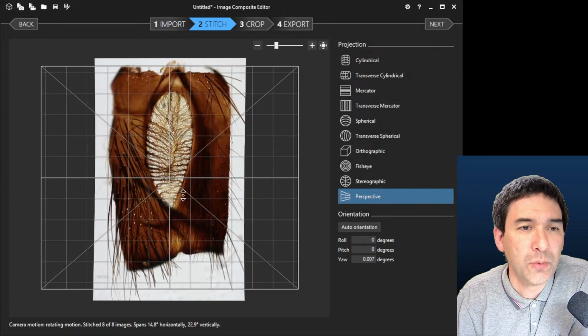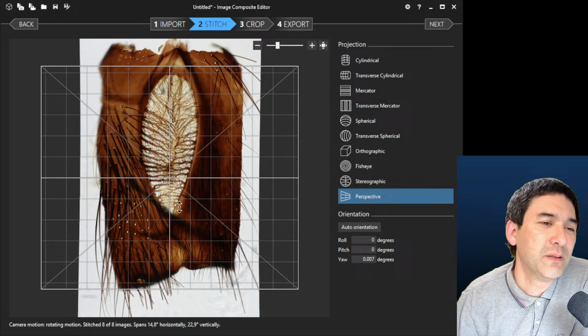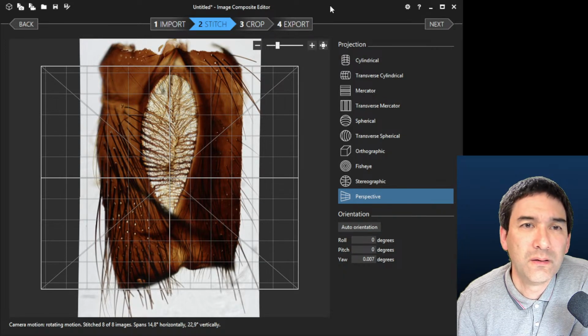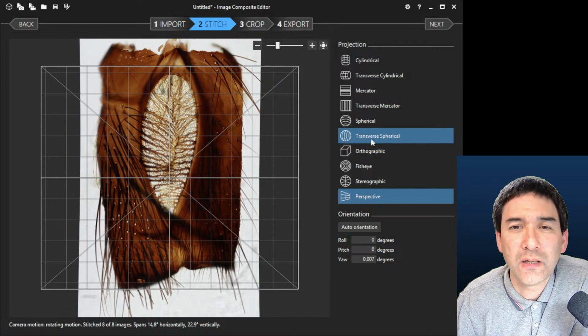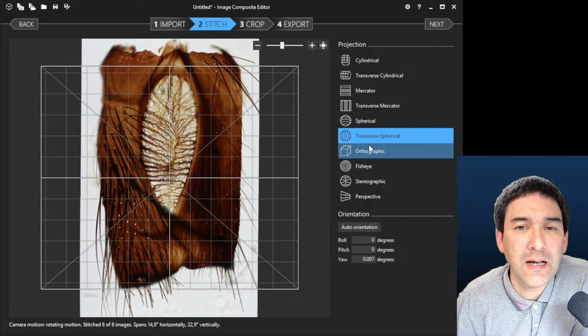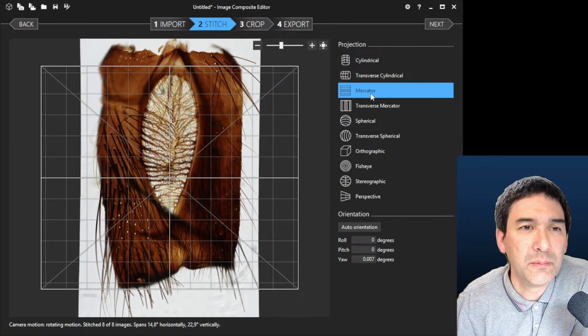It's quite small. It's interesting. You do see a little bit of a cushioning effect, so it's a little bit thicker here and thinner here in the middle. So maybe this is not the best. Let's go to Stitch again, or maybe spherical. What would that be? Look, that's nice. You see that it tries to compensate a little bit.